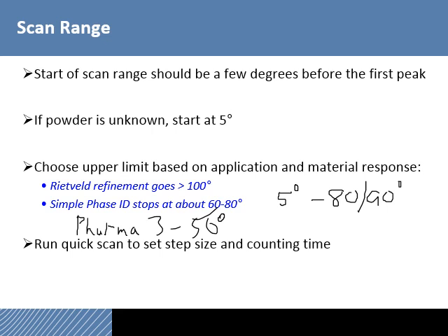The time is something, though, that you really do need to think about and take advantage of. The longer the scan, the better. You'll improve the signal-to-noise ratio. Your limit of detection will go down. But you need to run the quick scan to assess that.